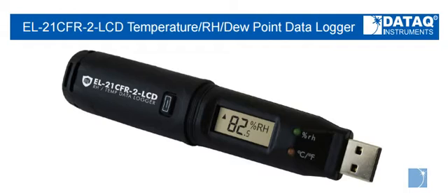The included EZ-Log software allows you to configure the EL21CFR-2-LCD via a USB port and upload data for analysis using the EZ-Log USB Graph Utility.